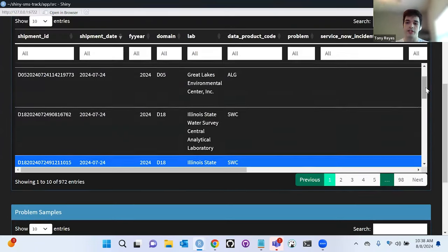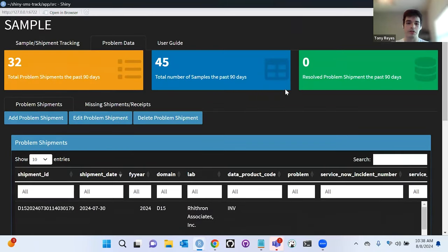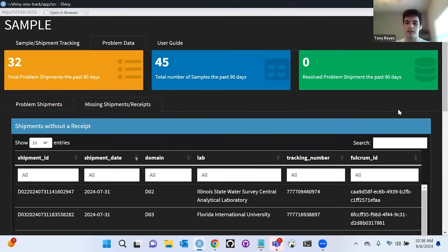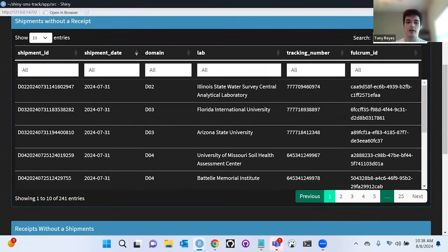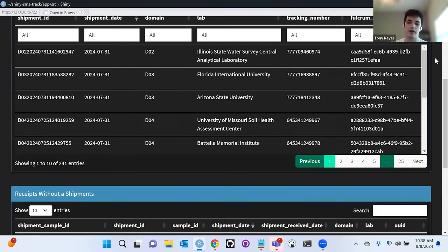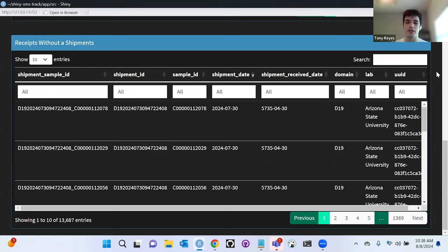On the other tab of the problem shipments dashboard are the other two tables: shipments that haven't been received yet — here you have them with a tracking number, and you can still search in there — and receipts without shipment, where you would see all the receipts that don't have a matching shipment, which might be worth looking into.